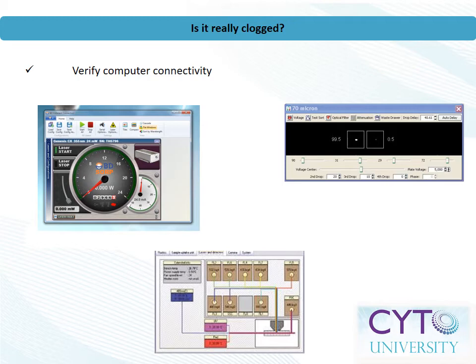For cell sorters with automatic drop delay, delay beads can be used to determine if sample is making it past the flow cell and into the sort chamber. Run the drop delay beads as a sample and engage the optical filter for drop delay. If you cannot see events on the plots but the stream camera can see the beads, there isn't a clog. If no beads can be detected either on the screen or by the side stream camera, there may be a clog and you should proceed with further steps outlined in this presentation.